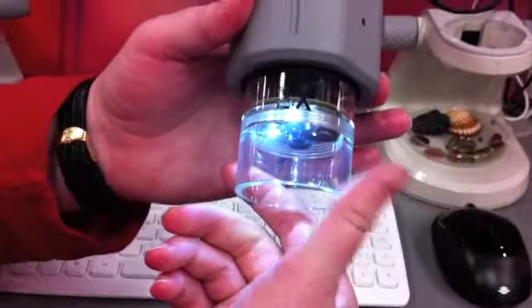Okay, kind of looks like my skin right now. That's kind of nasty, but okay. And then it goes up to 100x. Okay. Let's do that again. Are you focusing it now? Just a little bit on the 10x, you have to do just a little bit of a change. But it's definitely parfocal on the 20 and the 40. Okay, cool. So we go from 20x up to 100x.